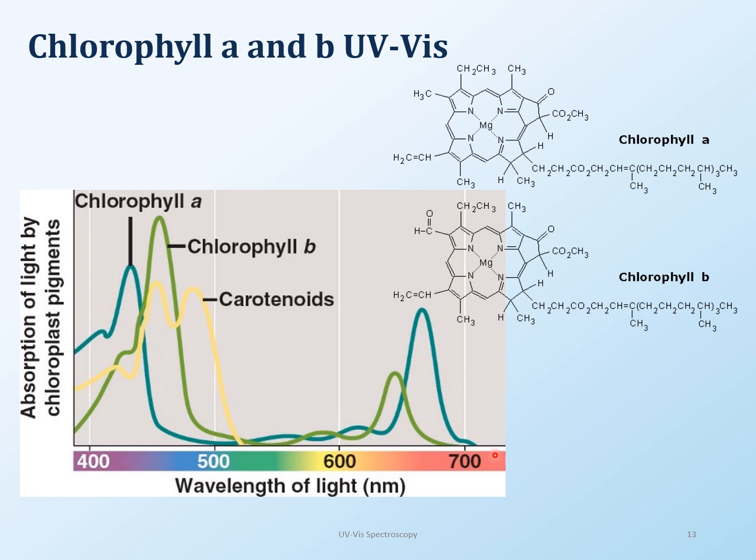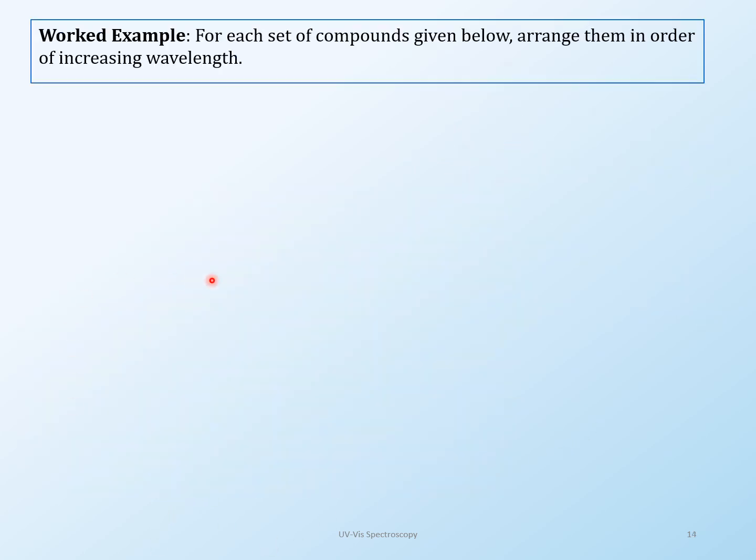But look at the spectra of it. What I wanted to show you here, again, nothing for you to remember if you don't want to, is how big these lambda maxes are, and also the fact that you have such a huge peak on the right side, on the red side, which tells you there are a lot of electron transitions going on. Just to show you, that's all.